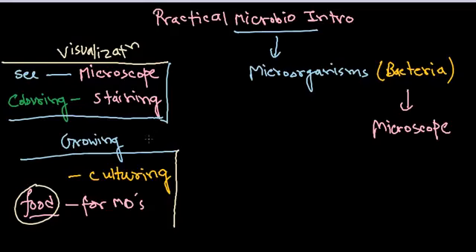Now once you have done this thing, now what else you need to do? Sometimes you need to look for the number of microorganisms, you need to count the number of microorganisms, right? So that's also required when you're dealing with them. So it's simply like microorganisms are your pet. If you are a microbiologist and you are going to work a lot with microorganisms, they are going to be like your pet. You need to see them, you need to take care of them, you need to grow them, you need to apply food for them. So many things are required there. So similarly, sometimes you need to count, right? So to count them and look for them, whether what's the structure and what they are doing actually.